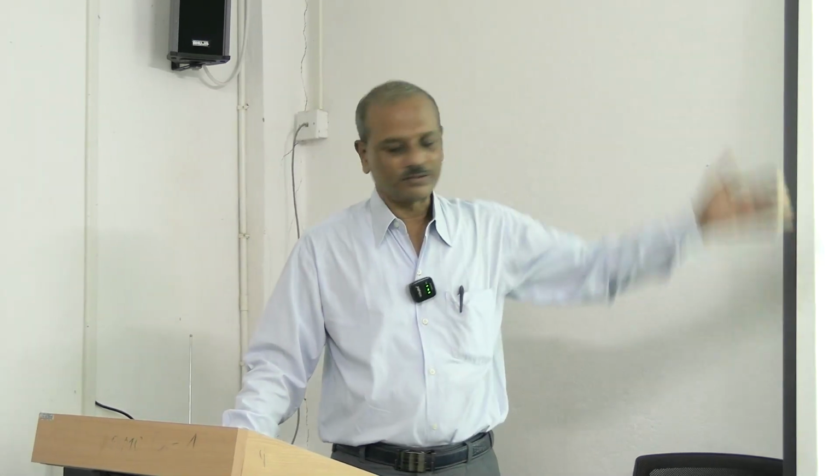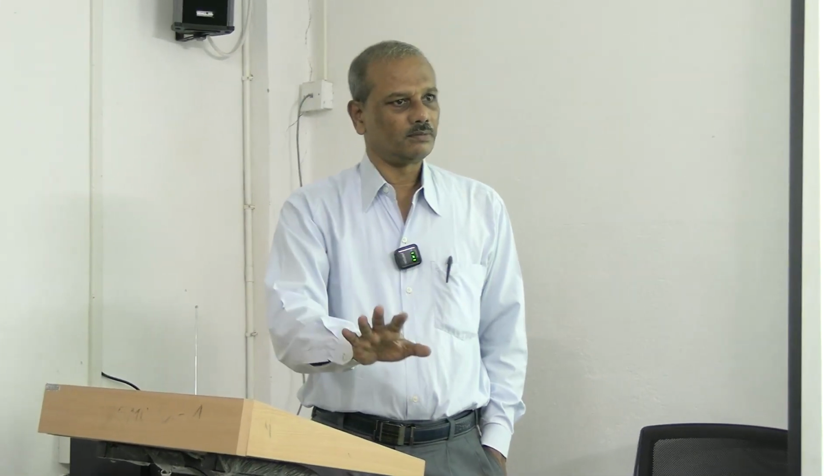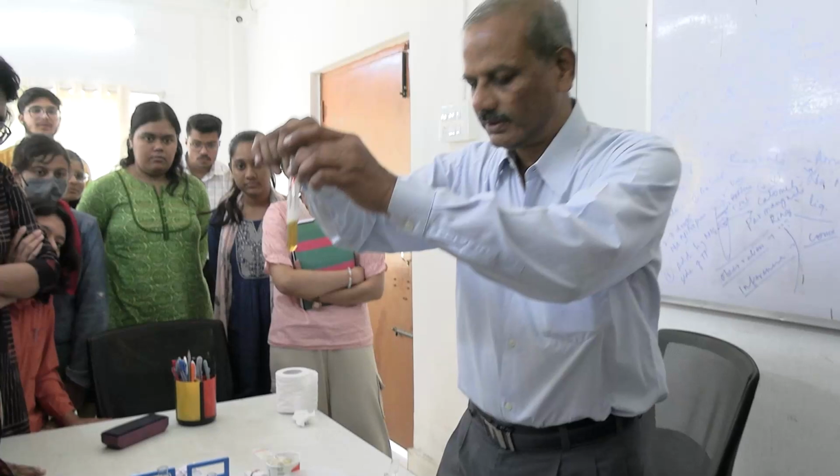Sucrose is prepared from glucose and fructose, so either glucose may be present, or fructose may be present. This solution will be prepared in front of you, and you can see it. First you concentrate on doing the urine test. And those who are interested to see this thing, just stay back. So do it fast and come to me. Otherwise, it will be very difficult to manage within 1 o'clock.